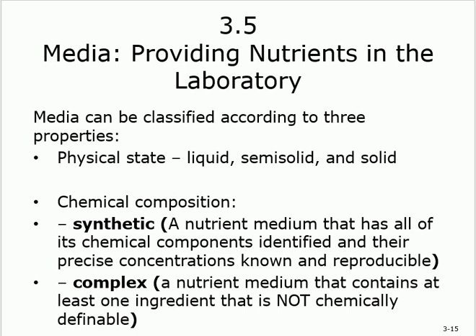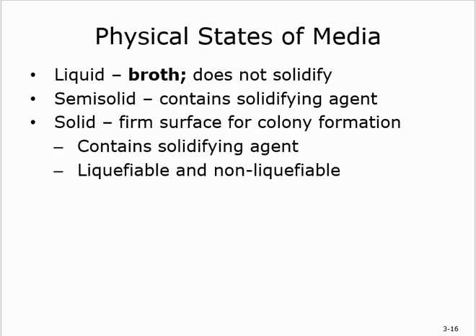All the numbers are known to you. Or it can be complex, means you don't know everything about it. So according to the physical states of the media, it can be liquid, it can be solid, it can be semi-solid. Liquid is like broth. And remember that the liquid does not solidify. It will not become solid. Like broth, you get a meat broth for example, and you put it as a source of nutrients to the organism. You put the organism on it, that's it.